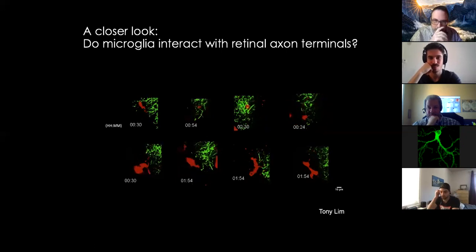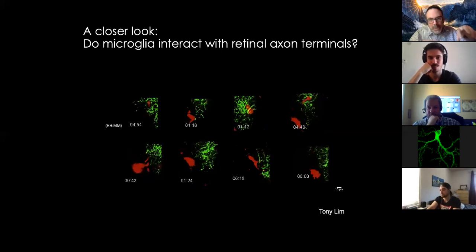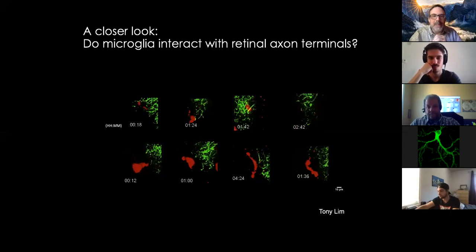So we see both microglia wandering into the neuropil and microglia extending processes into the neuropil region where they contact the axons. Is there a possibility then that they're actually phagocytosing axons during this process?